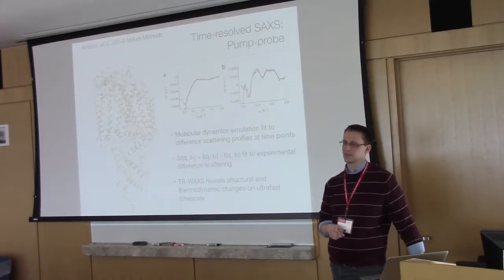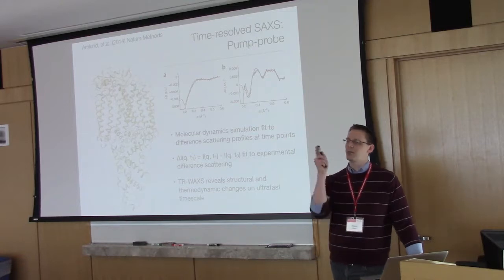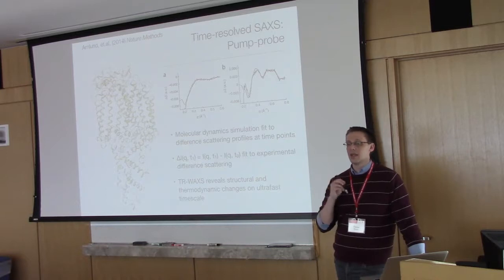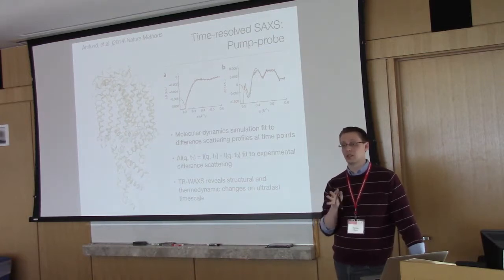The answer is almost always complementary biophysics. Yeah. Oh, actually, before I answer that, one thing that you can do is the molecular weight will change as a function of aggregation, right? You'll see shifts in molecular weight, but if it's conformations, you should get the correct one.